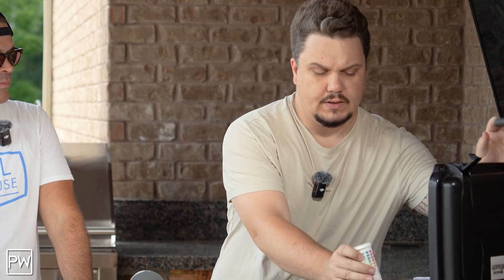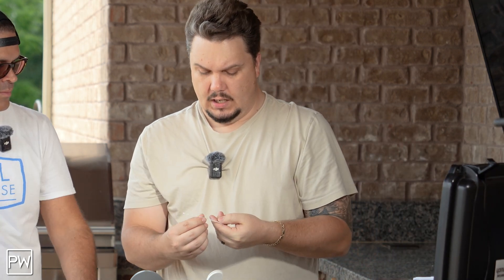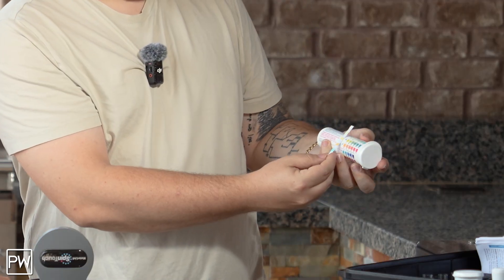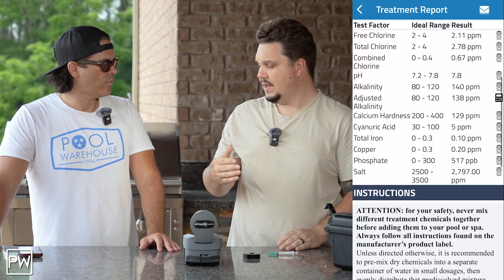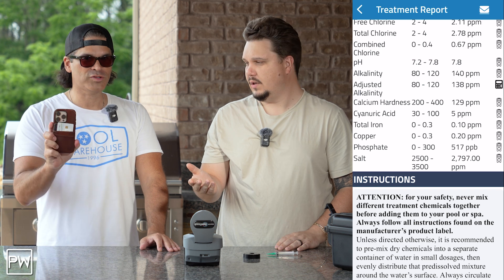Normal water chemistry, water testing — you're using these little test strips, probably super familiar with this. You dip it in the water, you read the color of it against this chart. This unit will do that. The Spintouch will do pretty much exactly that, but it does it digitally, way more accurate, way more precise, and it will spit out a reading in a test sheet. It'll actually shoot it to a phone app — Android or iPhone. We'll show you that in a minute.